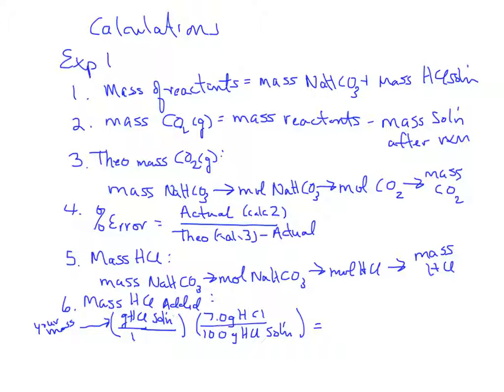Okay. Calculation 3, it says calculate a theoretical mass. Anytime you see theoretical, usually think stoichiometric calculation. The sodium bicarbonate, this messy white stuff over here, this baking soda, I get baking powder and baking soda mixed up. This baking soda is your limiting reactant in both of these, okay? So to get to the mass of CO2, you're going to start with that mass, about 3 grams. Do a stoichiometric calculation. Of course, you'll need the molar mass of the NaHCO3 to get to moles.